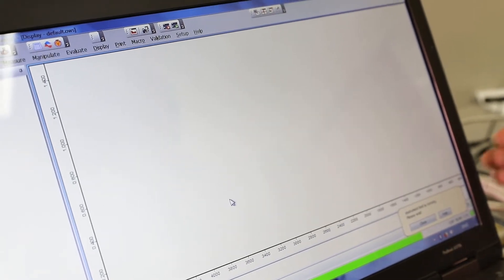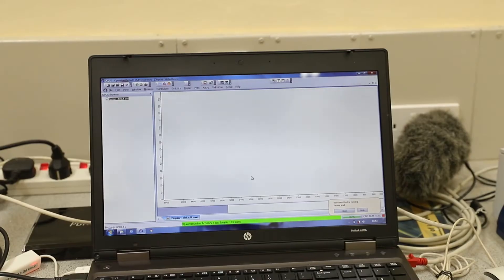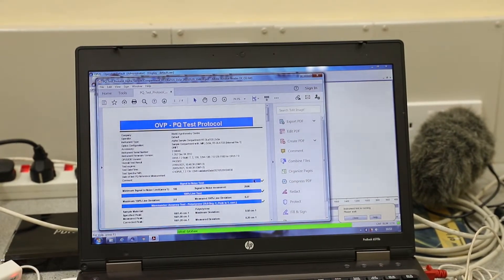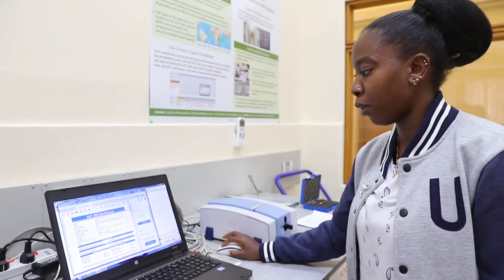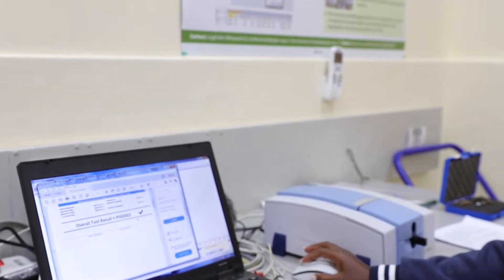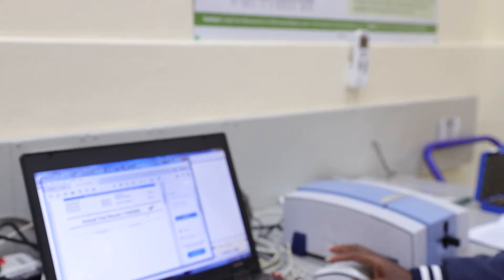This will run the Performance Qualification test. After the instrument has completed running the Performance Qualification, you can see the report here — the overall test results has passed. So the instrument is good to go for sample analysis.